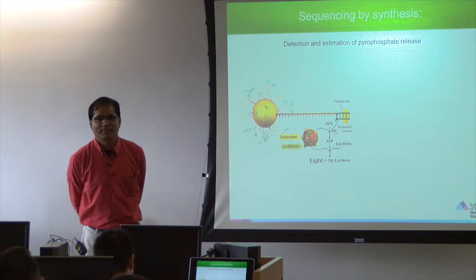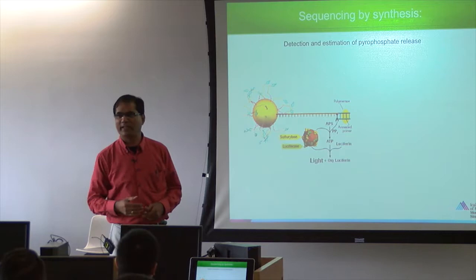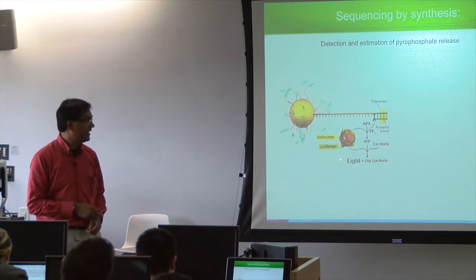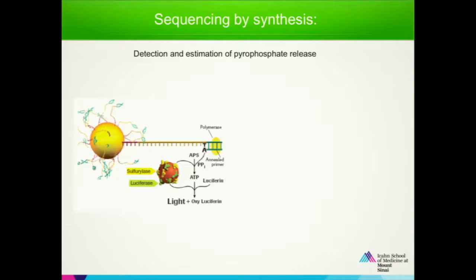And that's exactly how the first next generation sequencing technology came into being around 2005. This was popularly known as the 454 technology. You must have heard of 454, right? Wherein they use the sequencing by synthesis method using these different chemistries, and then they said that we can detect light. Use the camera to detect the light there. Almost a million wells they used. And that's how suddenly, from billions, the human genome sequencing came to millions.